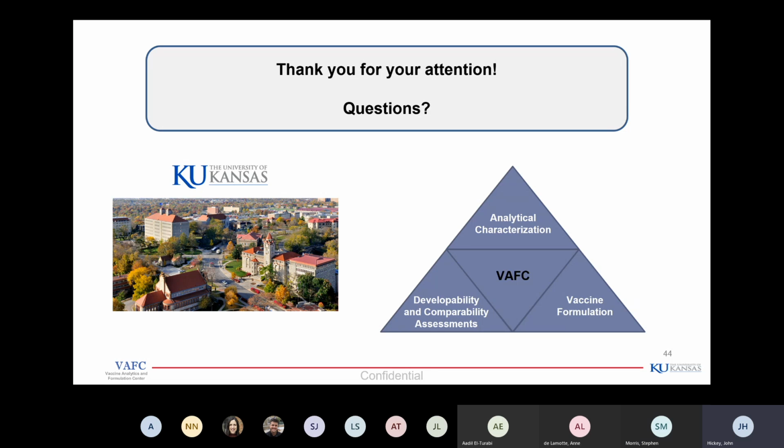So Steve, I have a question for you actually. How much do you think in the processing field is incorporated for any MS-based techniques, or is it primarily for gels and those kinds of things? Well, I think a lot of the processing field is relying on gels and so forth. But in a way, our collaboration with the Ultra is an example of the limitations of that. We had that epitope at the terminus, and for function, as far as we know, that epitope is essential, and it was getting processed off.